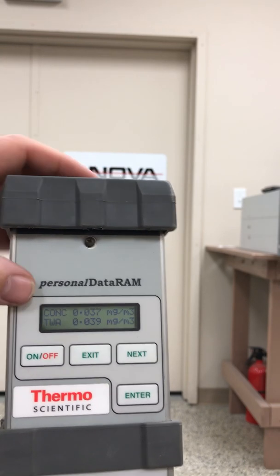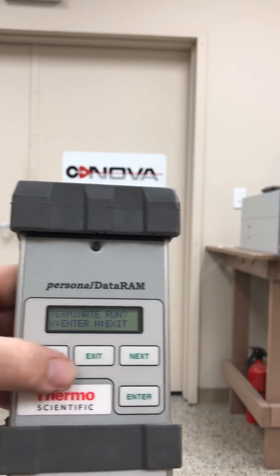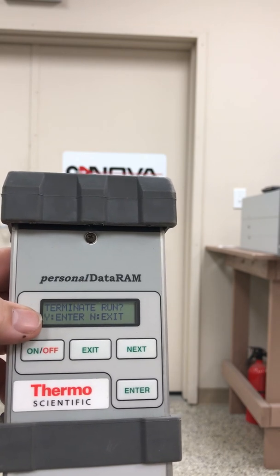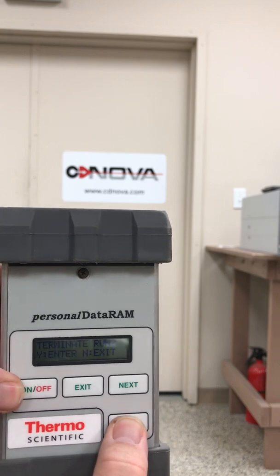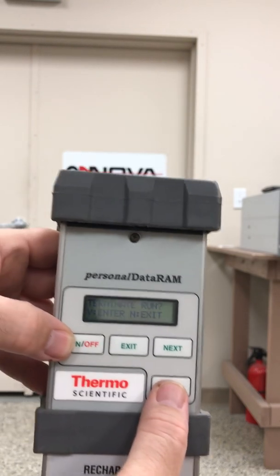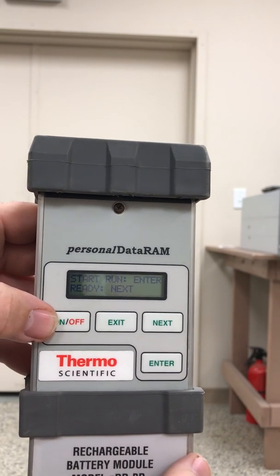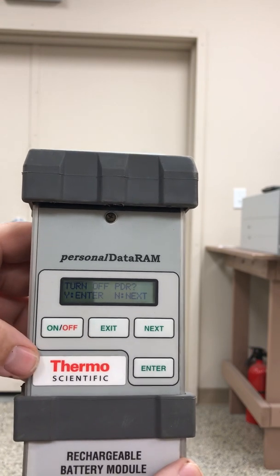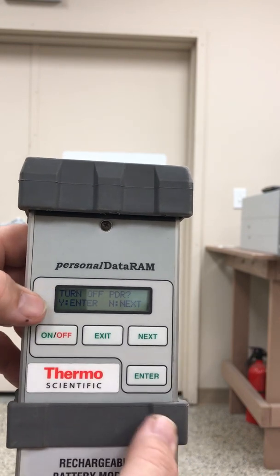To stop the unit, just simply press exit. It says terminate run — if yes, just press enter; if no, press exit. So if I want to terminate, I'll just press enter. It then shows start run or exit. To turn off the PDR, if you want to turn this unit off, just simply hit yes or enter, and it's off.